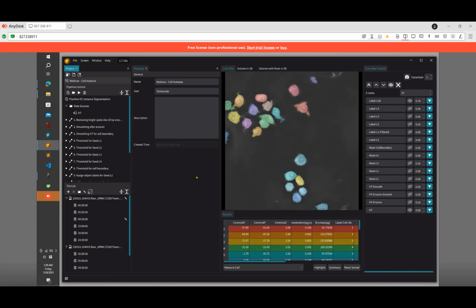As I said, we are not focusing on the tracking function at the moment because of the difficulties I've mentioned before. So if you want to do tracking, you should do it yourself at the moment, and you can use the exported data sets to get the job done.